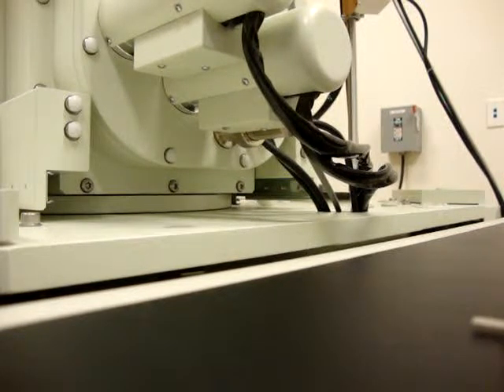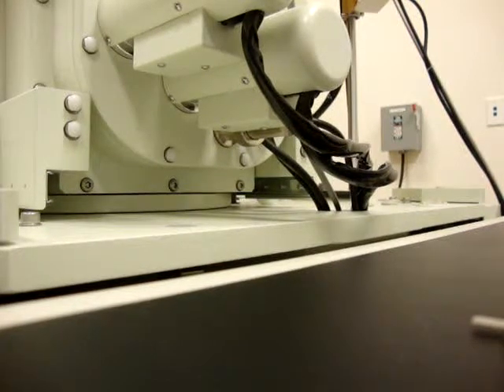You have modes in which you can operate. Observation is the most common one that you'll be using. When you're in observation, you get all the voltage, acceleration, and probe current directly over here. You don't have to go to setup.